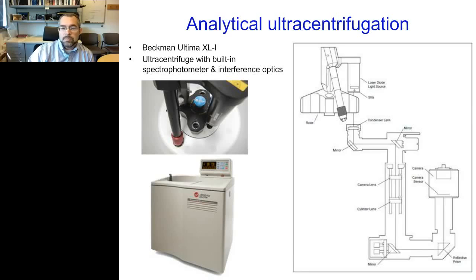So here is the basic cutaway view of what the inside of an analytical ultracentrifuge looks like over here on the right. I'm going to turn on my whiteboard here so I can make some notes. What you'll notice on the right-hand side is an illustration of the rotor. This is what contains the samples.